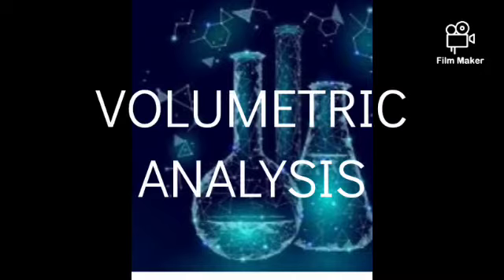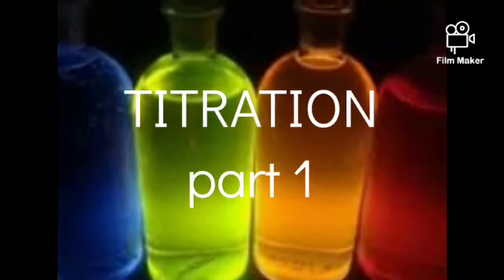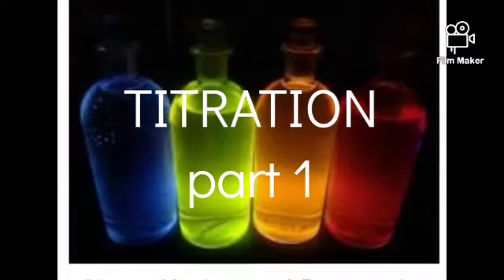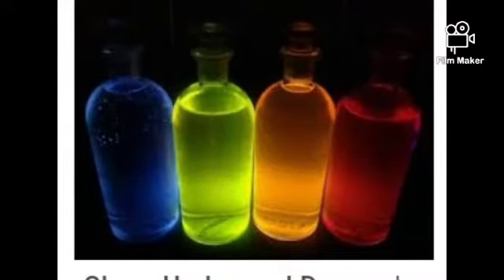Today we'll be talking about volumetric analysis, and under this we are going to be talking about titration. Of course, this is going to be part 1 because it's a very wide topic and we are going to have it in almost 3 parts.